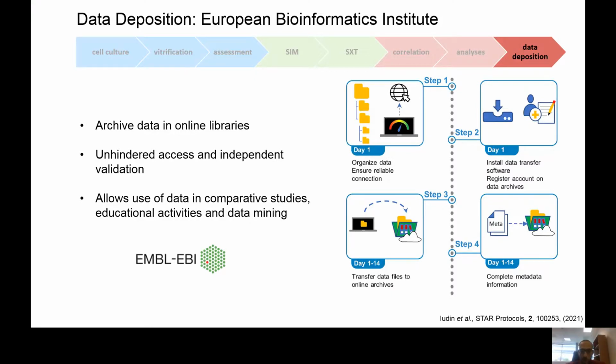We have a protocol, in collaboration with EBI, the European Bioinformatics Institute, describing data deposition steps into their online archives for this type of data.